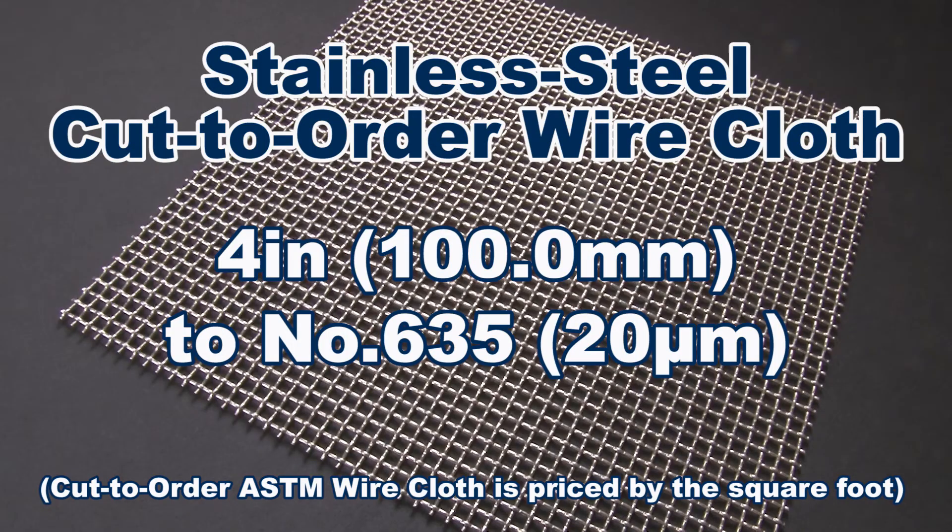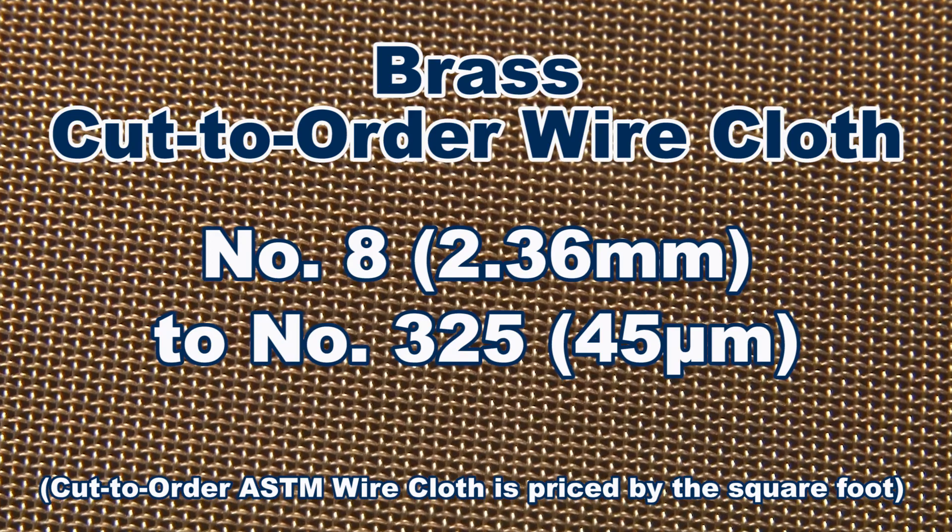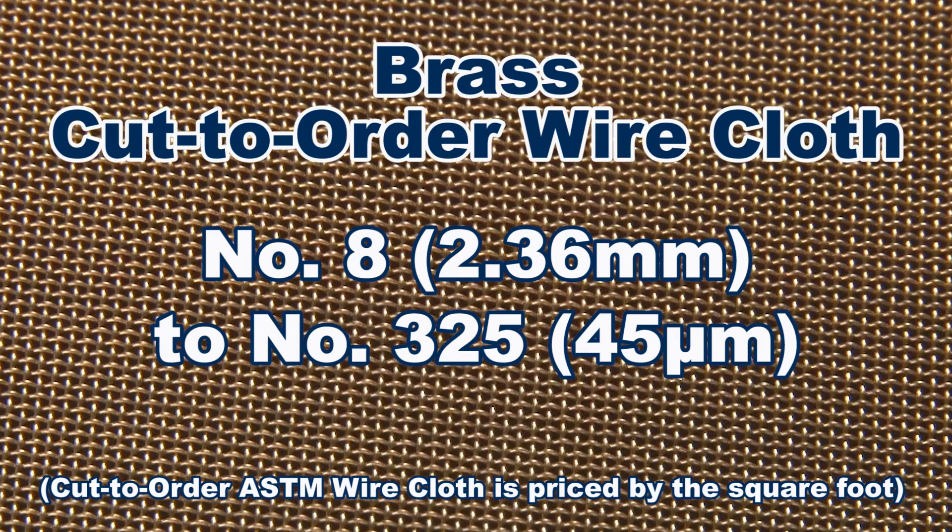The stainless steel cloth is available in openings from 4 inches to number 635, whereas brass cloth is available from number 8 to number 325.